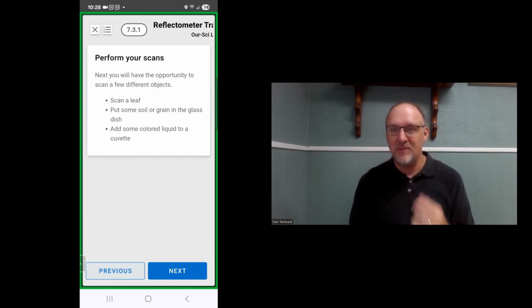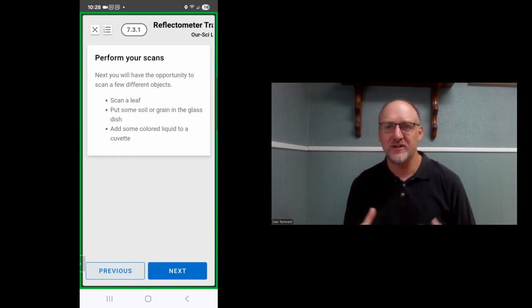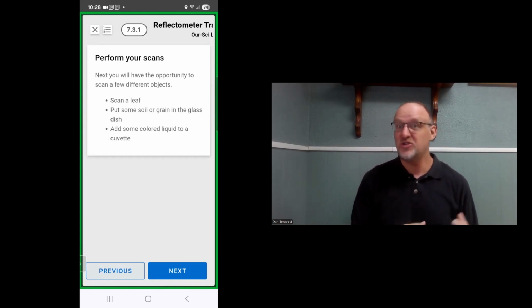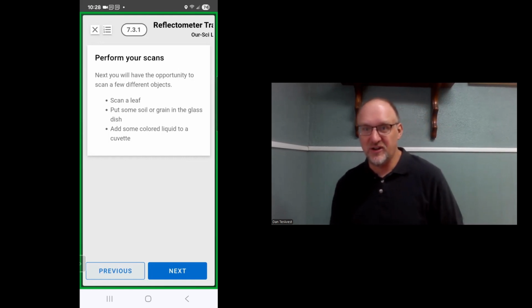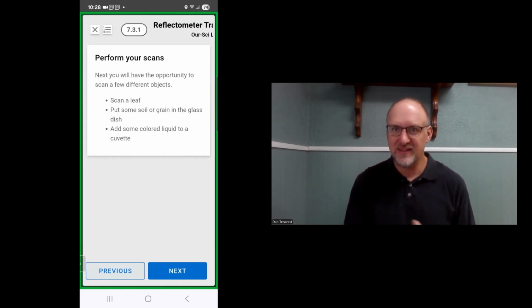So in the field, at best, people are going to be able to use a sieve or a colander or something else to quickly homogenize and break up the soil clods. So you should only be using the same thing or something similar when generating your calibration data set. So key things to consider.